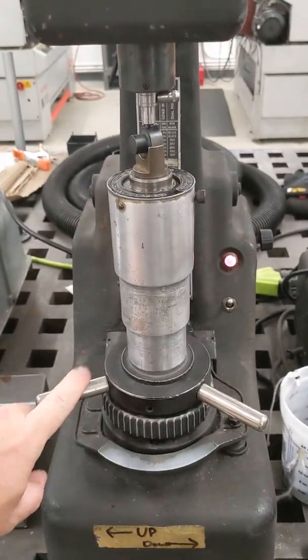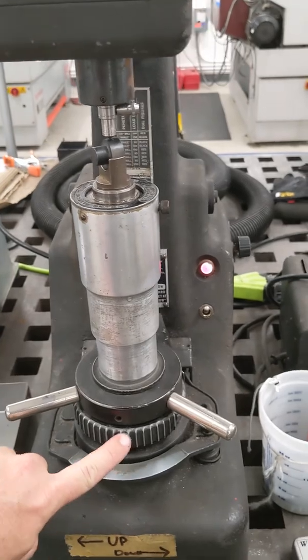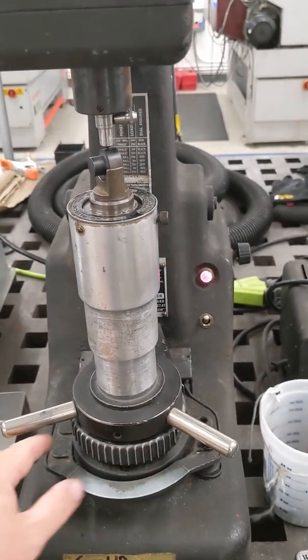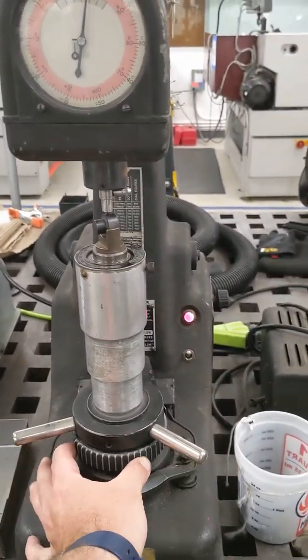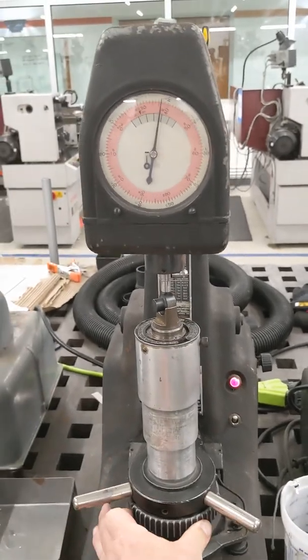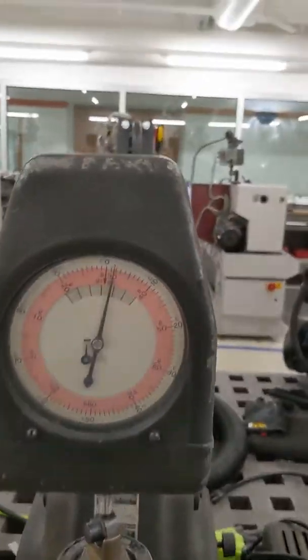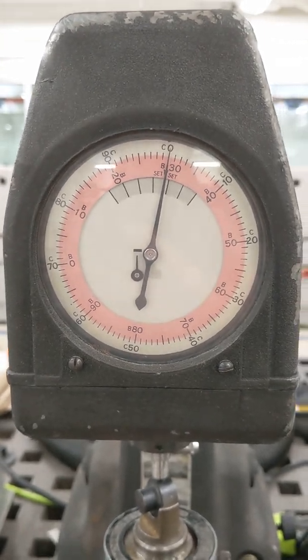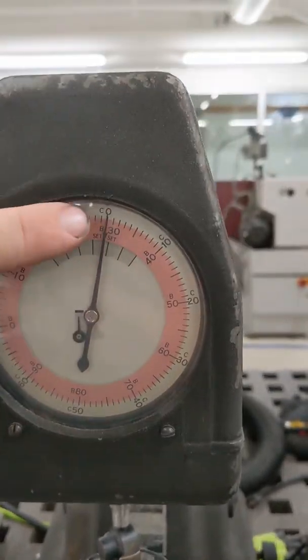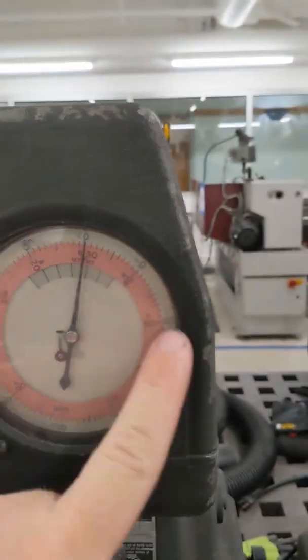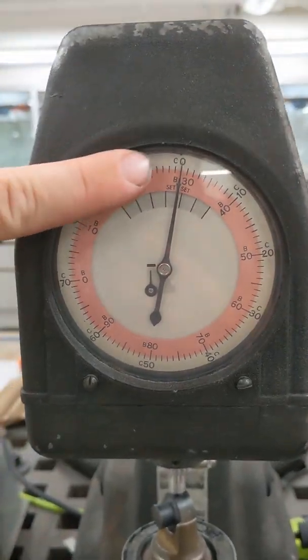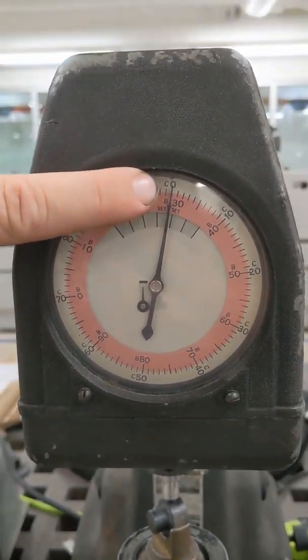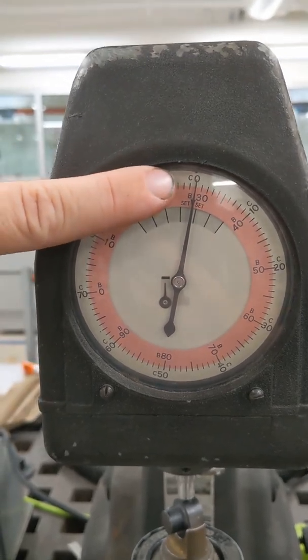Under the handle that you use to raise and lower the sample is this ribbed collar. If I rotate that back and forth, that rotates the scale, and that's how you zero your measurement. I'll rotate that collar until the needle lines up with zero. We're going to read the hardness on the outside of the scale where it's marked C. Since we're using the Rockwell C scale, we're going to read the numbers on the outside.